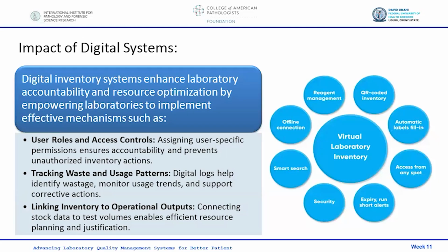What are the impacts of digital systems? They enhance laboratory accountability and resource optimization by empowering labs to implement effective mechanisms such as user roles and access controls.